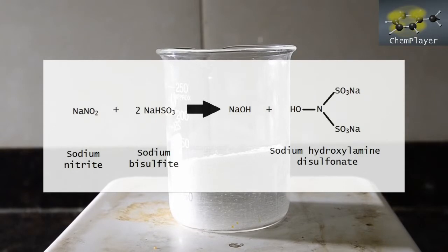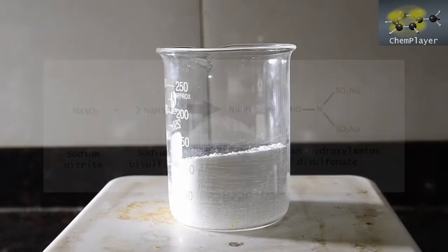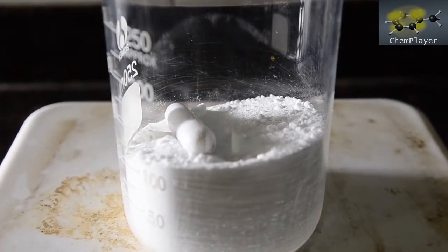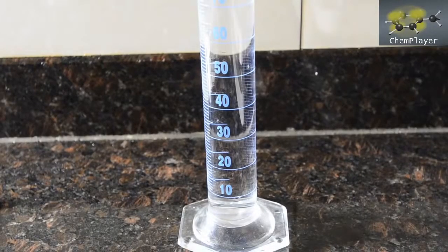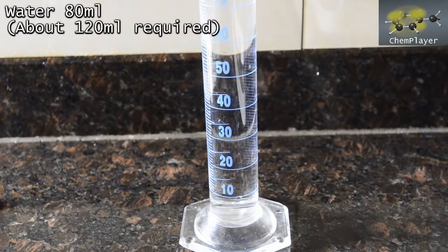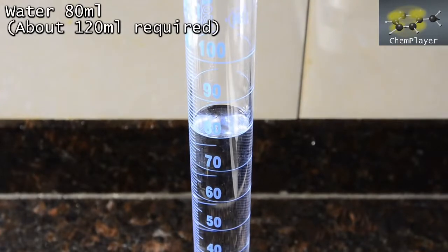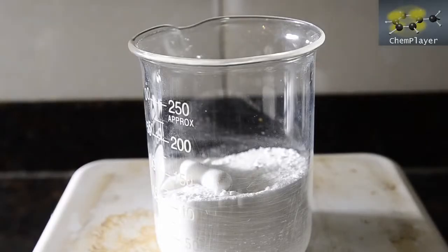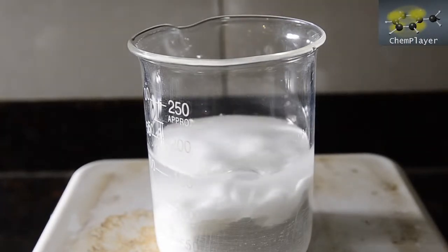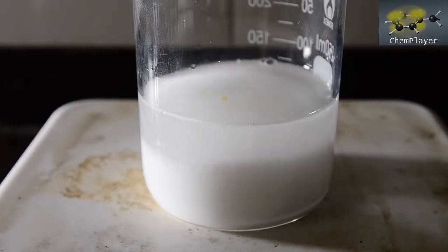First we've got to dissolve the bisulfite in the minimum quantity of cold water to make a saturated solution. So first we add a magnetic stir bar. And now we've measured about 80 ml of cold water to start with. We'll probably need a bit more. Let's get this into the beaker with the bisulfite, and we'll get this stirring to start to dissolve the solid.